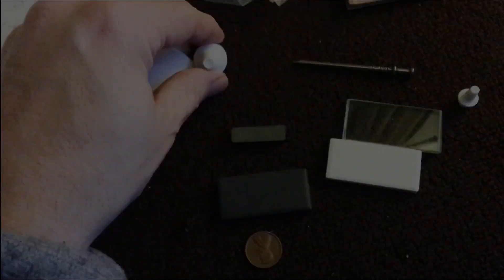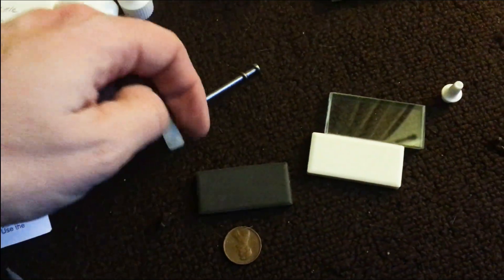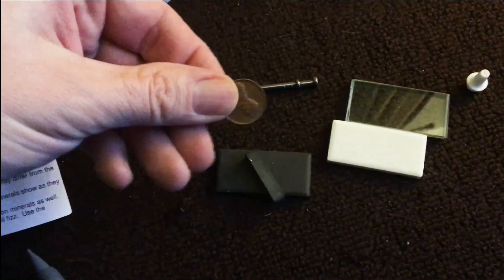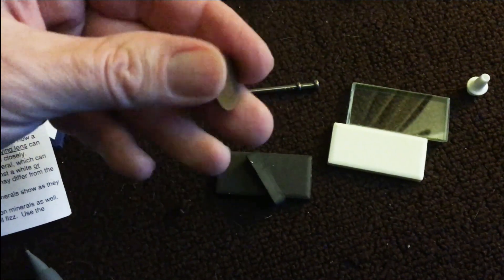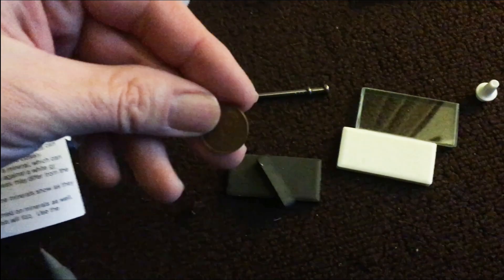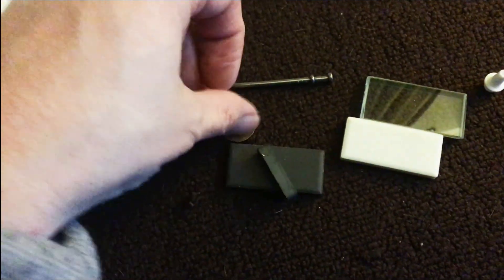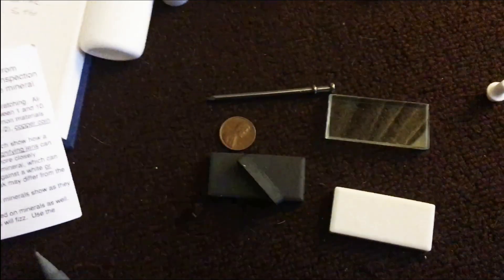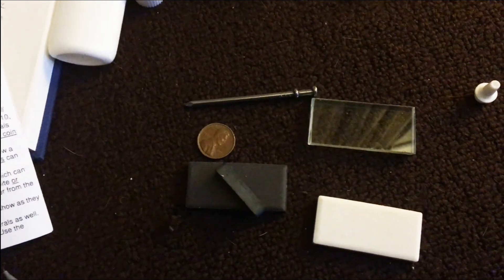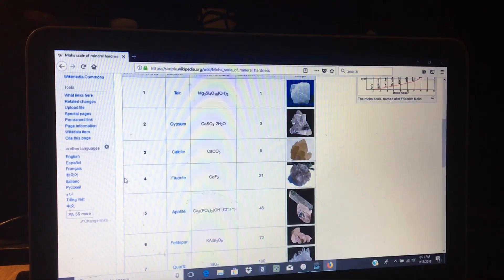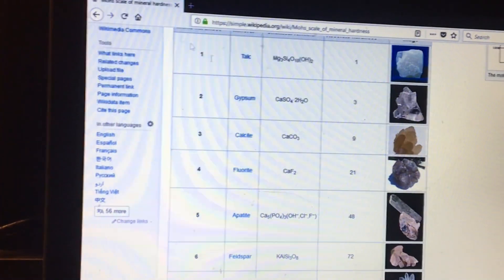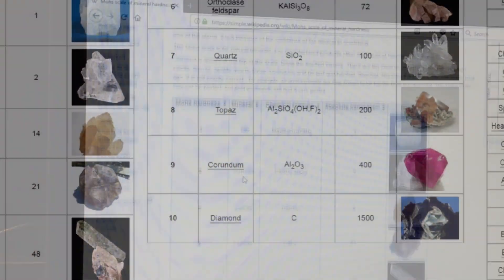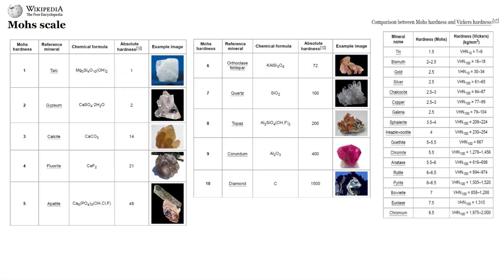I'm going to show you step by step how we can identify something like this — even though it's likely man-made — by using standard mineral testing techniques. This is the acid, which I'm not going to use. This is a magnet — just stuck it to the nail. We're going to use this nail for hardness. The kit came with a penny, but it needs to be a copper penny, so it has to be a pre-1982 penny, which the kit did not come with, so I had to get one. The kit also comes with a steel plate and a piece of glass. Now here's the Mohs hardness scale — it goes from one through ten, listing the defining minerals, their chemical formula, and their absolute hardness.